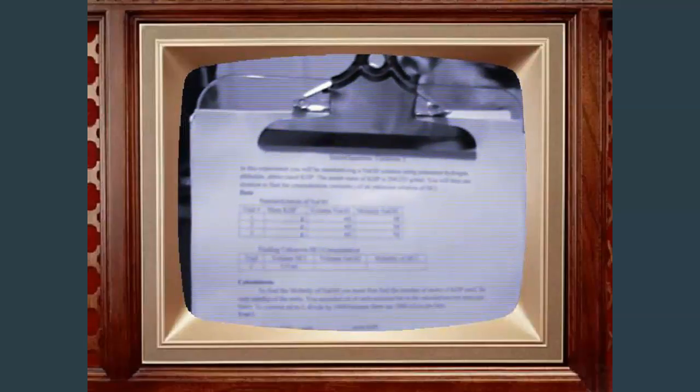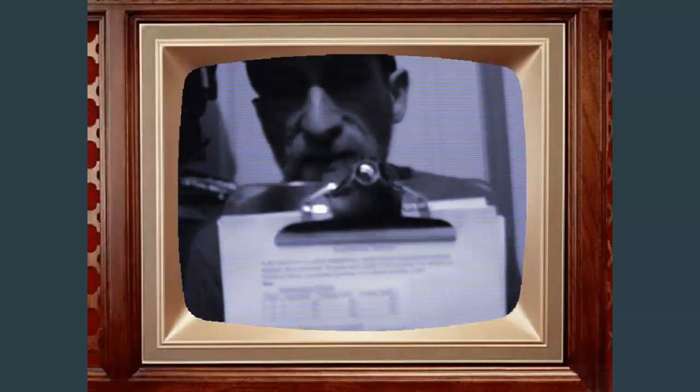Now, I have also made a data sheet, so this is available on my Google Classroom. If you're watching this and you're not actually in my class, just send me a message or comment down there in the comments, and I'll be more than happy to email you the data sheet so you can keep track of it as I go through the lab. So this company that we're using is called Smart Sparrow, and it's Smart Sparrow Titration 1. So we're going to find the concentration of an unknown solution of hydrochloric acid.